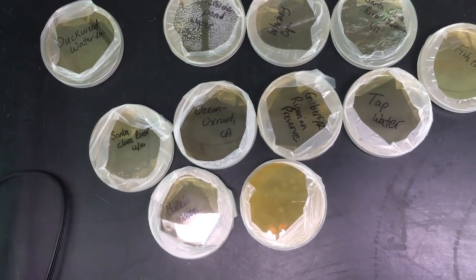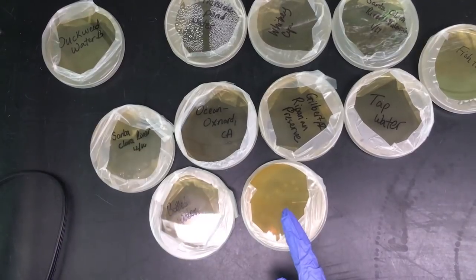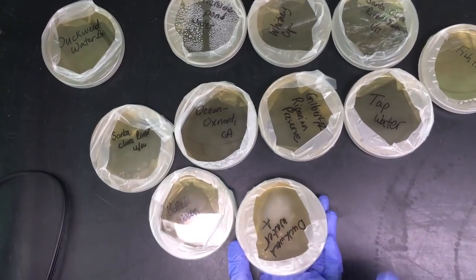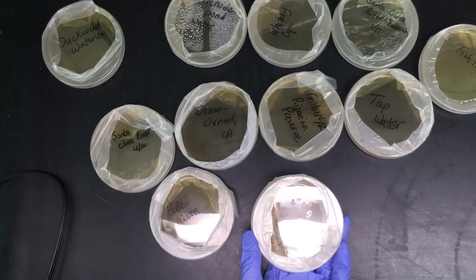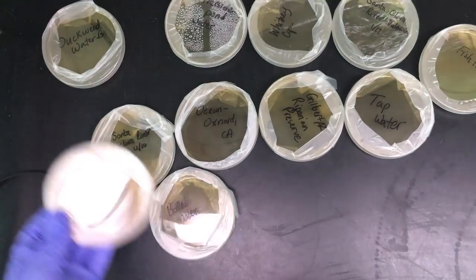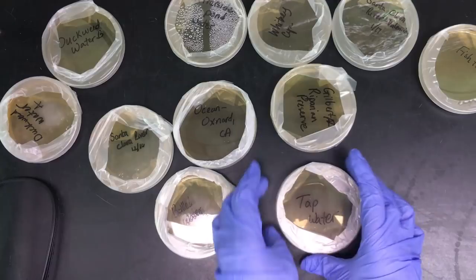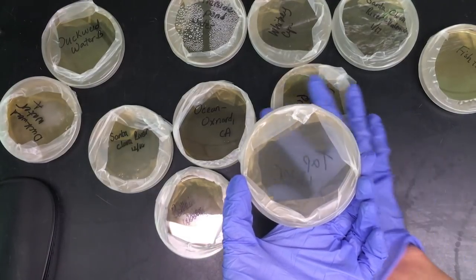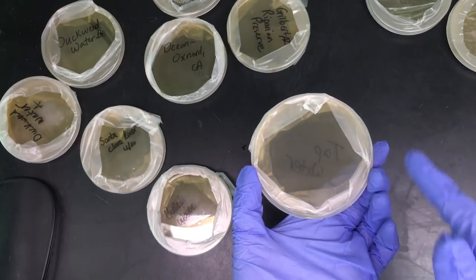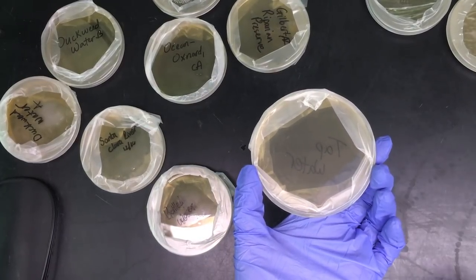Let's go ahead and get the results of our coliform bacteria tests. So what we're going to do is we're going to look at the bottom of each of these to see if they grew colonies of coliform bacteria. We'll start here with tap water. This is just water from the tap and we turn it over and we can see here that there are no colonies which is great. There should not be any colonies in our tap water so this came back negative, zero colonies.